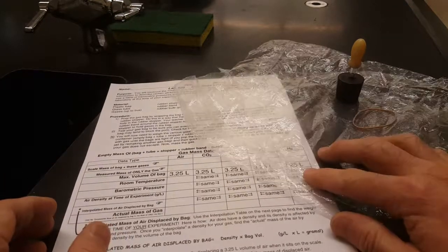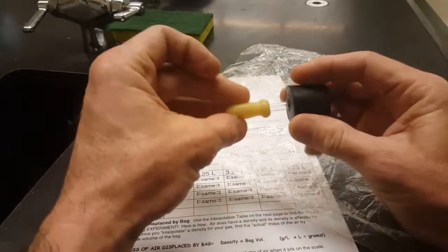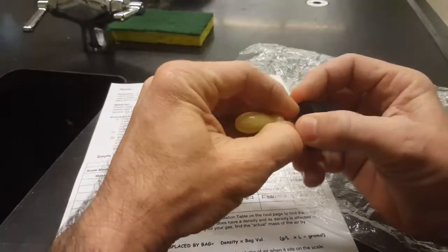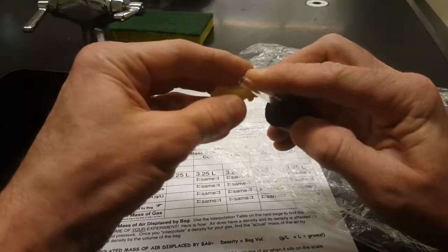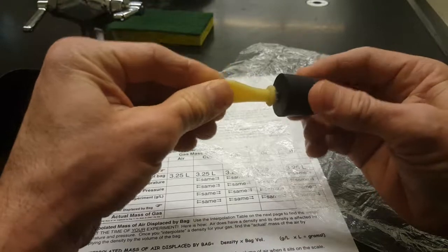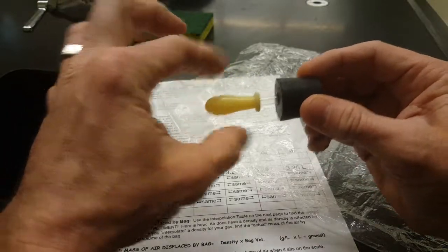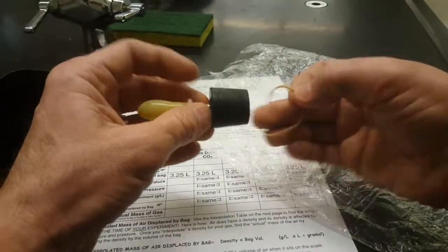Welcome to the gas mass bag lab. You're going to have a bag, and a stopper that has a hole in it. There will be a little rubber bulb on the end of a glass cylinder that goes through the stopper. Notice that the cylinder goes all the way through. The bulb is meant to stop air, or any gases, from going through that hole. And you're going to have a rubber band.